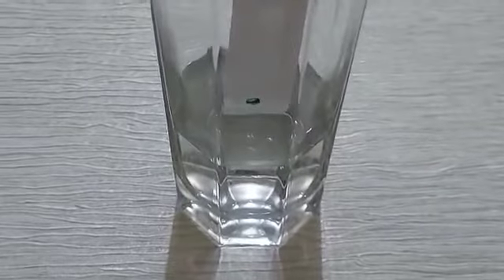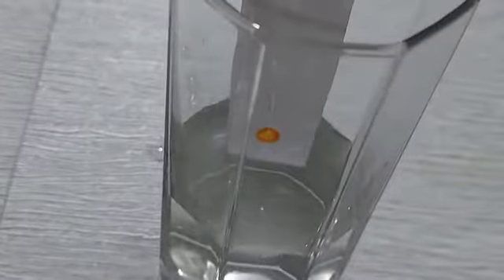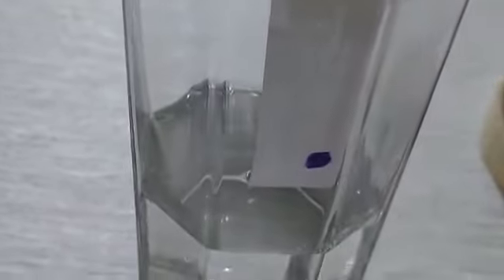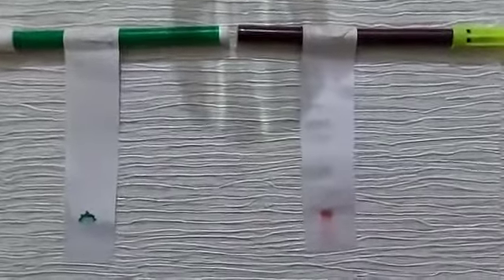Now we will observe what is happening. The solvent here, that is water, absorbs up the paper strips and flows along the paper through the spots, carrying the colors from the spot. As a result, we can see here the colors of the spot are getting separated from each other.